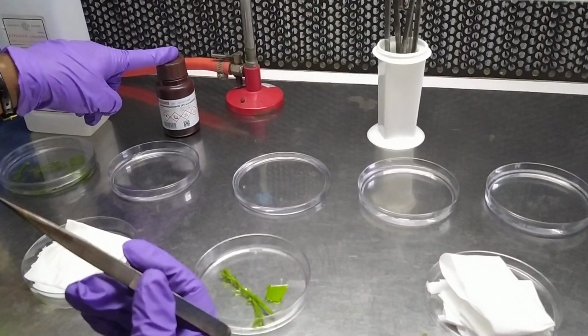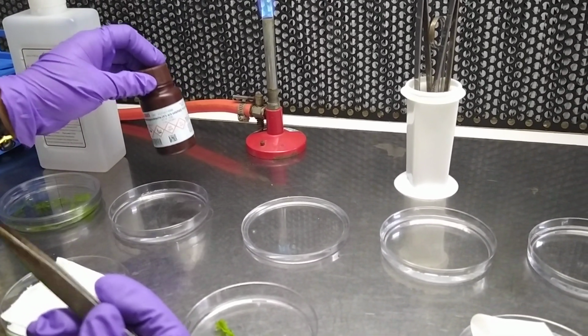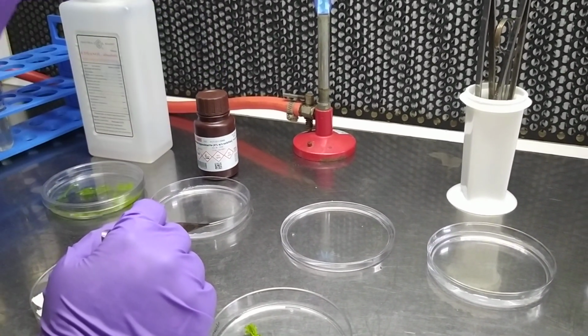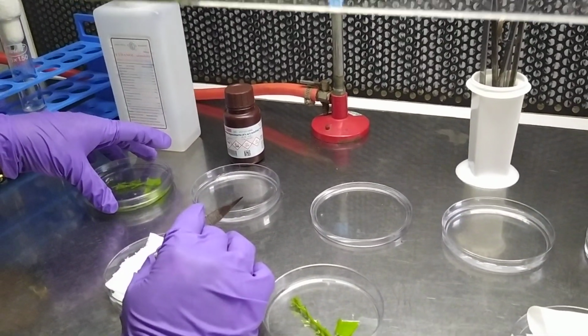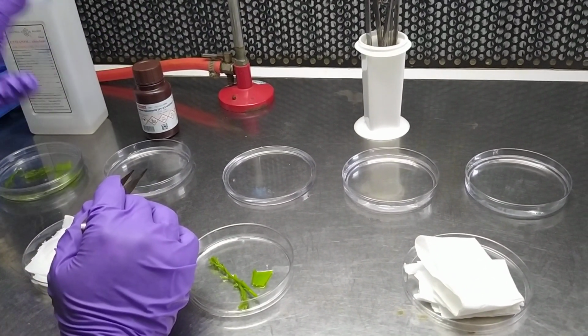It could be sodium hypochlorite or mercuric chloride; anything could be used for this. Depending upon the concentration, the exposure time varies. Ensure that the tissues do not get charred or burnt, so the exposure time has to be optimized before we put in the tissue.